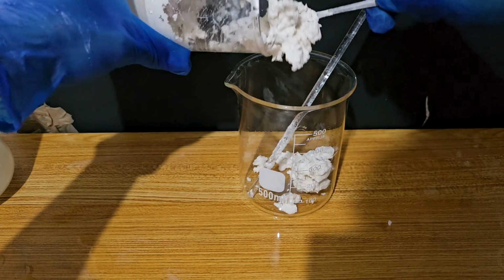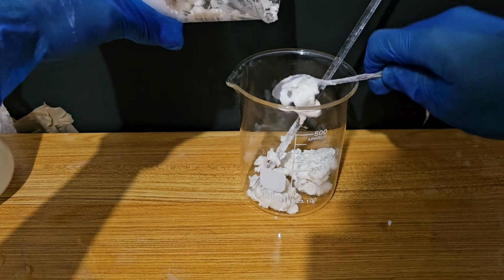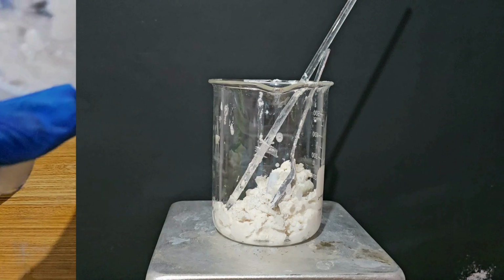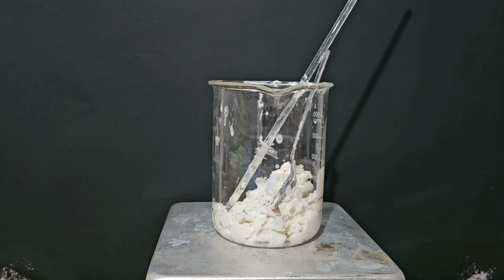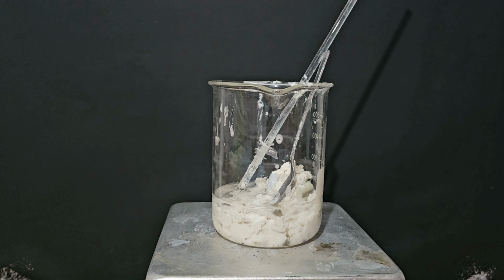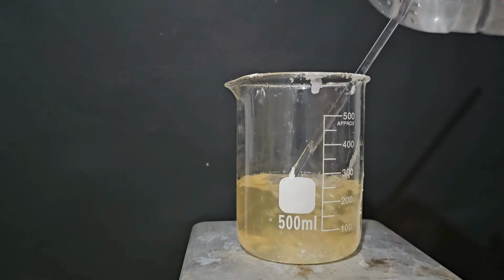Then I transferred all the solid into a beaker. After that, I added approximately 200 ml of 96% ethyl alcohol in order to perform the recrystallization.